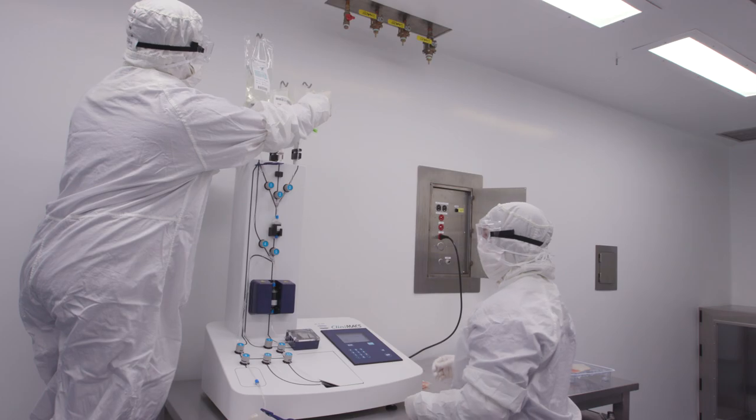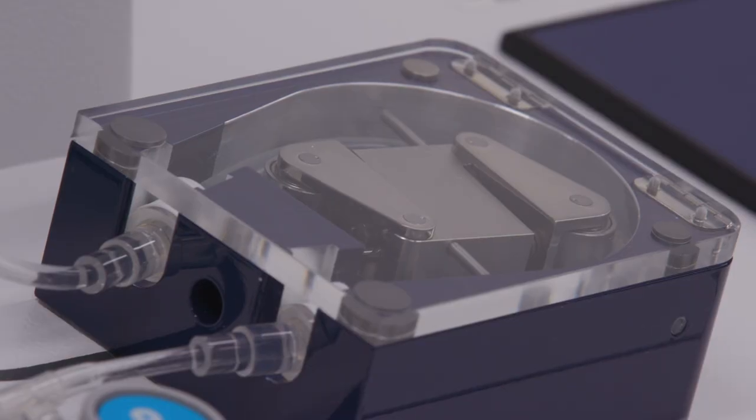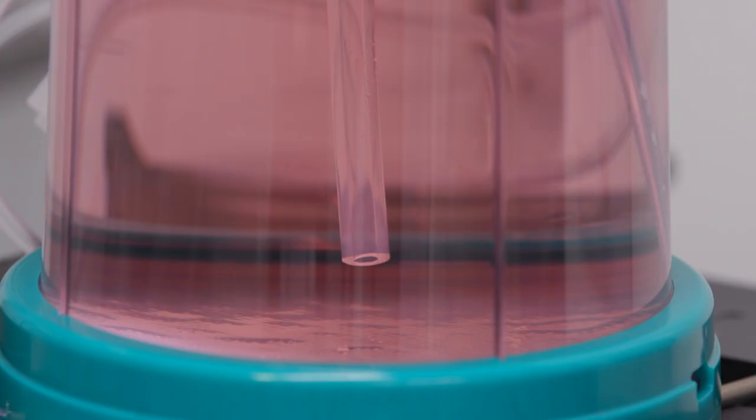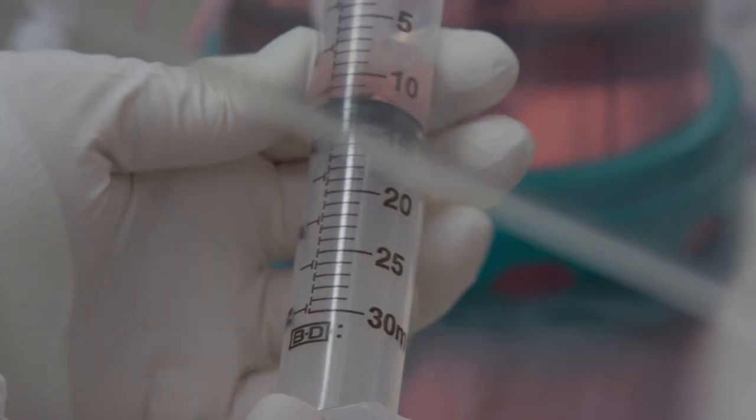And it's where they produce and test important components of gene therapy known as viral vectors. Viral vectors are tools molecular biologists use to deliver genetic material into cells.